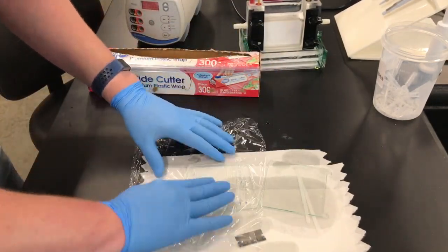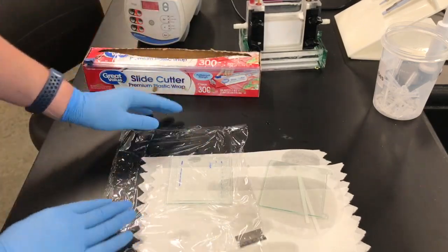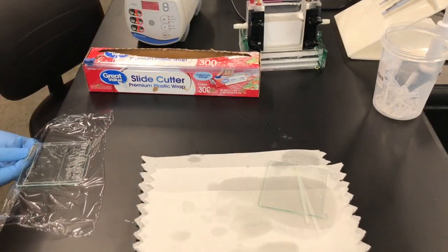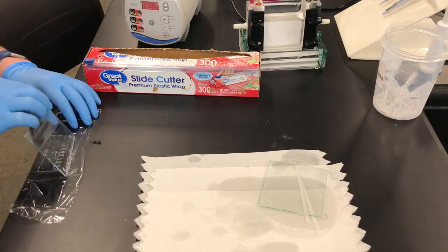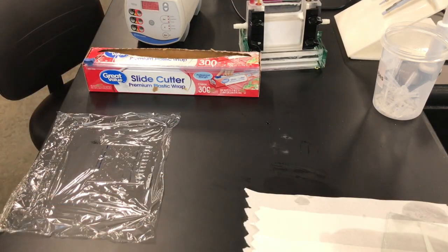Then, using some saran wrap, place it on it, flip it over, and pull the saran wrap off the table and use a razor blade to transfer the gel from the plate to the saran wrap.